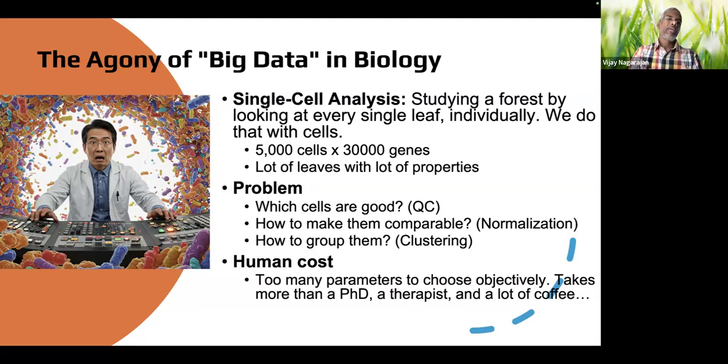So in a regular standard single cell experiment, this is the normal workflow. Very standard, very basic. You look at the cells, look at their quality, see how good they are, and understand how the quality is spread across all of the cells for all of the genes. Then you try to remove the bad quality cells, outliers, or cells that express, for example, 90% mitochondrial genes, in which case the cell is obviously dead.